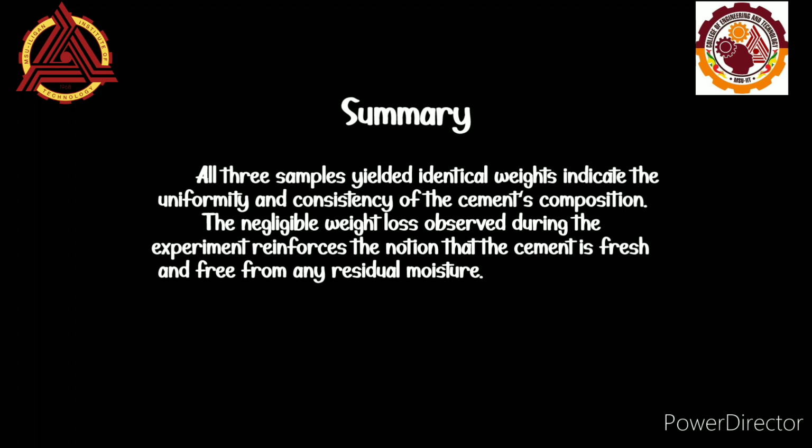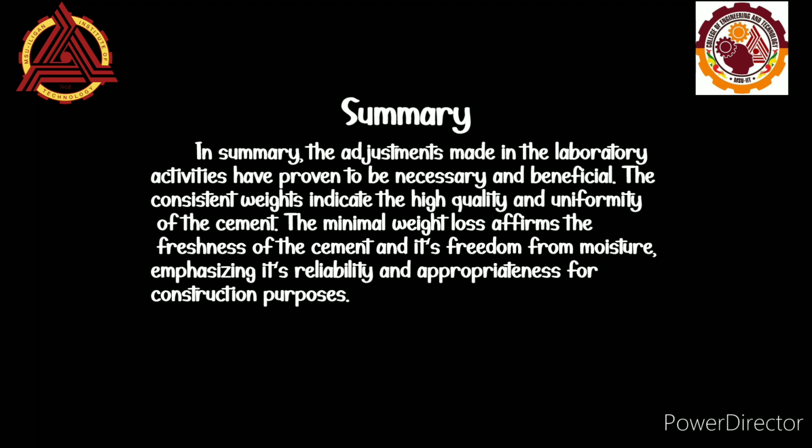In summary, the adjustments made in the laboratory activities, including the preheating of the drying oven and the extended exposure time for the samples, have proven to be necessary and beneficial. The consistent weights obtained from the 3 samples indicate the high quality and uniformity of the cement. Furthermore, the minimal weight loss affirms the freshness of the cement and its freedom from moisture, emphasizing its reliability and appropriateness for construction purposes.